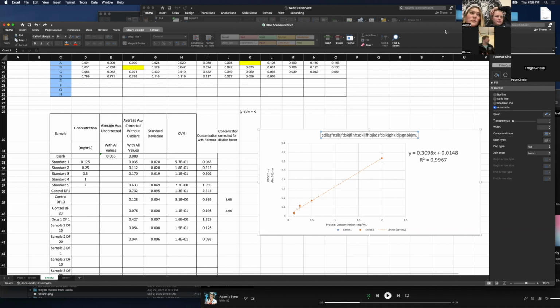Alright. So you guys had the same question. Tareem asked, do we need to correct? I think she's asking, do we need concentration corrections for the dilution factors for the standards? The standards come as is, so there's no need to correct anything. They're set as they are.